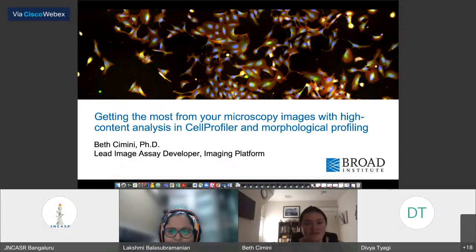I'm very excited to be here and honored to be invited, and really looking forward to talking to you guys. I'm going to tell you a little bit today about high content image analysis as done in CellProfiler, which is a tool that's been in the imaging platform for about 15 years now. And then tell you a little bit more about why high content image analysis is so important to us, and what are the sorts of things that by extracting more features than you possibly ever even thought you could use actually can end up helping you do really novel and interesting kinds of experiments.